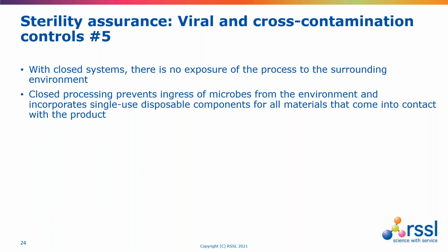All components and reagents should be pre-sterilized using filter sterilization. And this kind of level of robust control enables processing of multiple patient batches running consecutively.